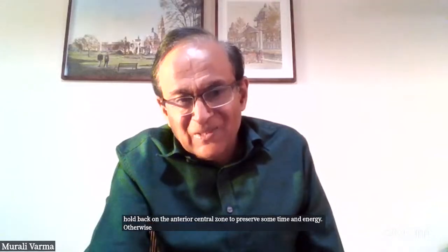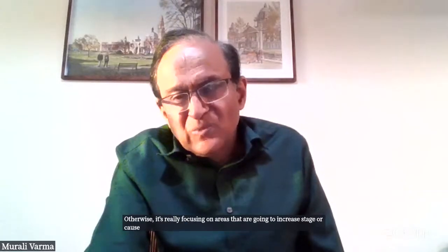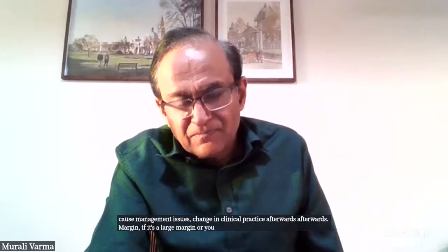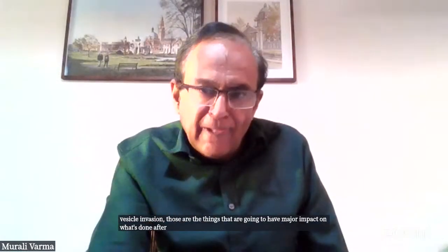Otherwise, it's really focusing on areas that are going to increase stage or cause management issues, a change in clinical practice afterwards. Margin, if it's a large margin or you see something near a margin, seminal vesicle invasion, those are the things that are going to have major impact on what's done after the prostatectomy specimen, and I think need to be focused on.